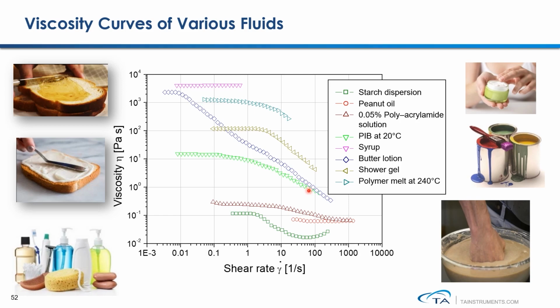The viscosity performance of a dispersion sample shows a more complicated case. Under low shear, a dispersion sample may exhibit a Newtonian behavior. And then, in moderate shear conditions, it shows shear thinning. But at high shear, up to a certain value, a dispersion material may also exhibit a shear thickening behavior.